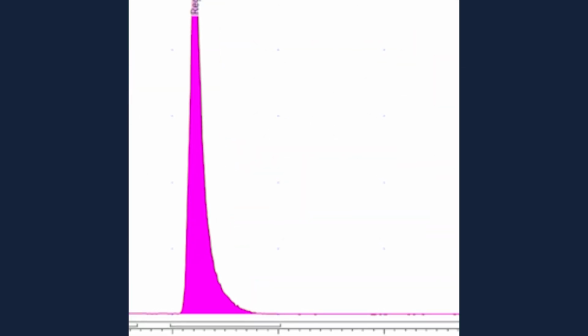By doing it in line and being able to take into account the continuum, because with your software you're able to really see where the peak starts over the background, you're only integrating the peak. Therefore, in the bismuth, even though it generates some Compton scattering, it doesn't get quantified because there's no peak. It only looks for peaks and doesn't just look for an increase in the noise.